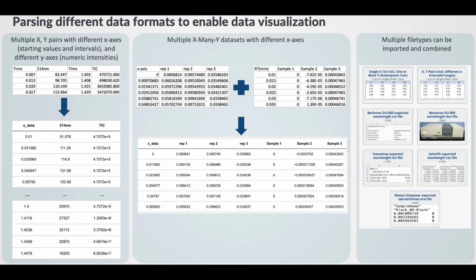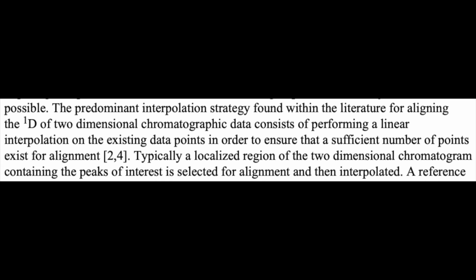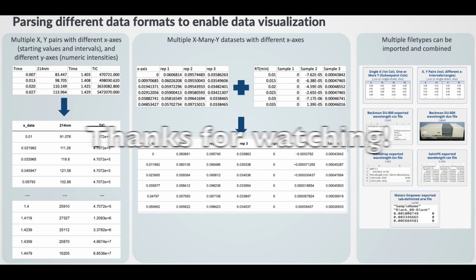And for data integrity, we follow the principles outlined in this NIH public access manuscript on interpolation techniques. Now, interpolation is a very common chromatography and spectroscopy procedure utilized in the industry. You'll find it among a number of different chromatography tools that are utilized by most, if not all, chromatography and spectroscopy vendors.